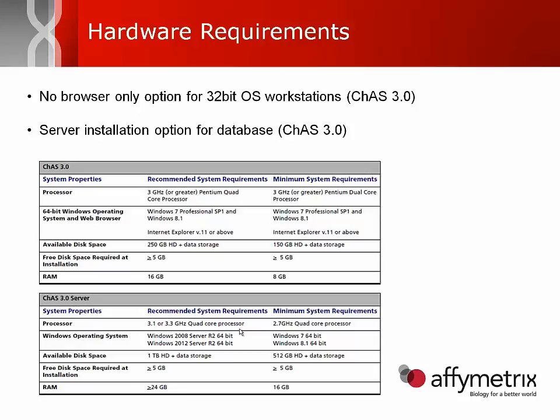What you will now see are some server requirements. So ChAS 3.0 does have this database option, and it's compatible with a Windows server, and so we do have the requirements listed here.